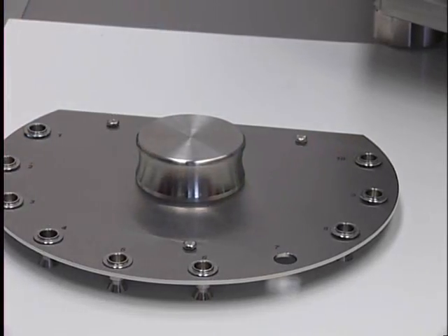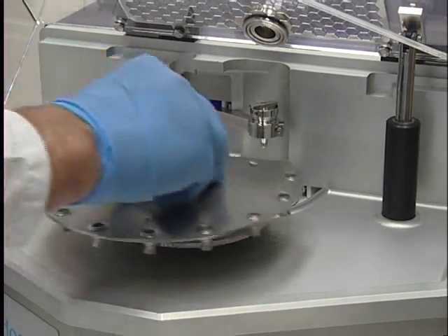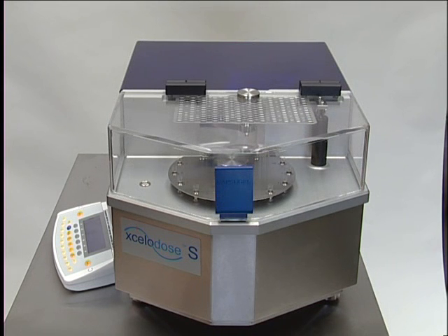Capsules are loaded into a container or body bush for filling. The dial plate is then placed onto the system. The Xcelodose 120S system is now ready to operate.